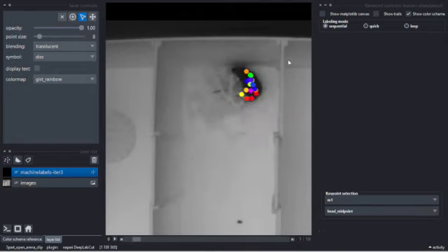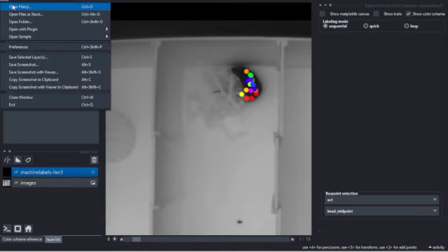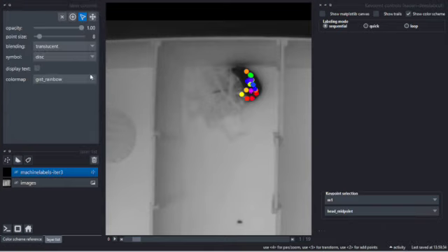So one major thing that we had a problem with for relabeling frames is once you have relabeled the frames, you're going to go to File and then Save Selected Layers. Make sure that you're on the Machine Labels layer. So you're going to go File, Save Selected Layers. And then once you do that, this creates a new layer that is not visible to you right now.